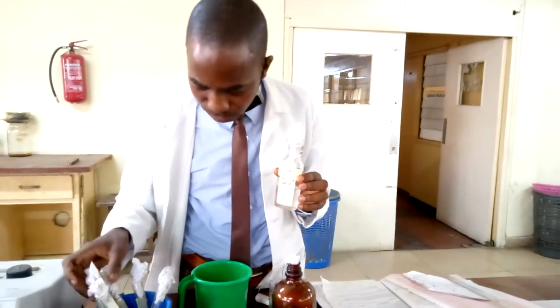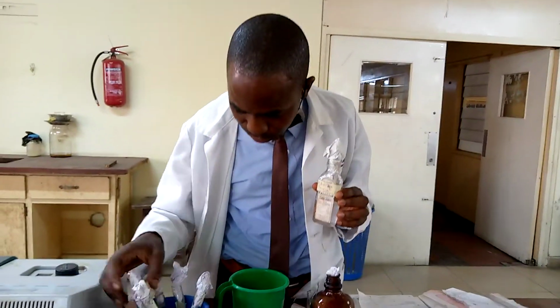Now, when you have taken the different volumes, you make them up to 1 mil with water. If I take 0.2 mil of my leucine in my first tube, I will label the first tube 0.2.